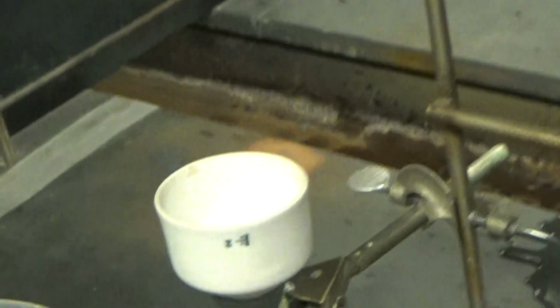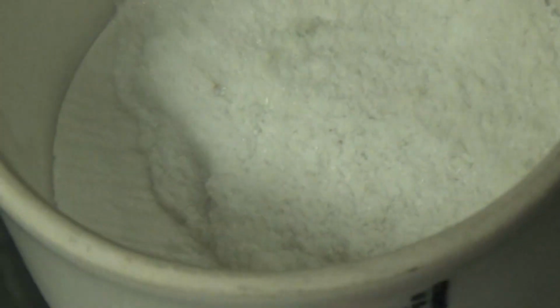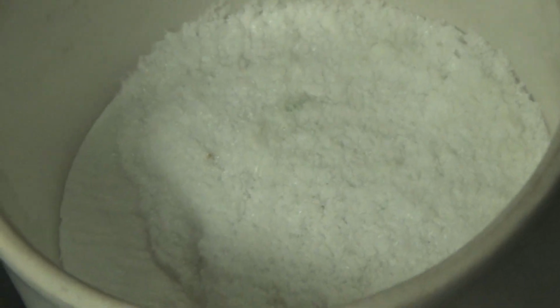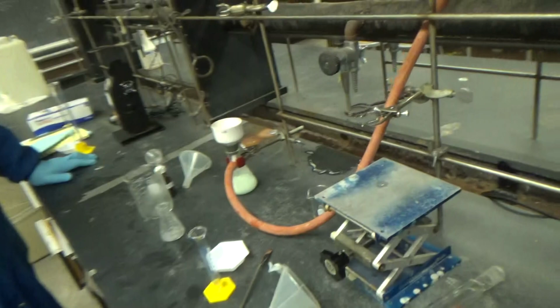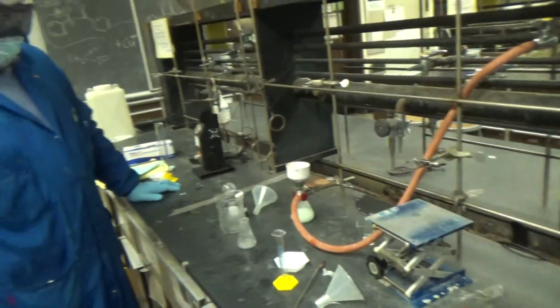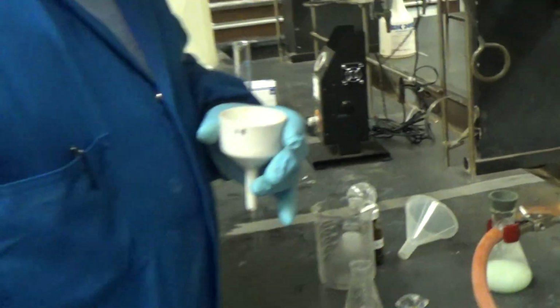Let's take a look. That looks really good. It's a lot. Also kind of a sugary white crystalline solid. Exciting. Then you let it dry for a bit? About a minute or so, just let it dry under vacuum. Alright, so we let it dry a bit. Turn off the vacuum, and then we go get a mass.